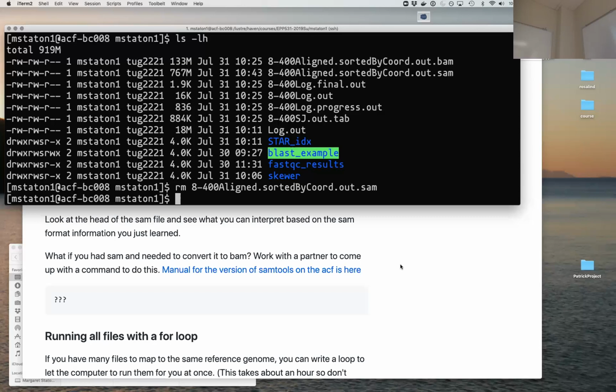I think this is a much bigger issue. You're getting like a third of the file. It's a massively different size file. And that's what I'm thinking. The question is, I don't know how STAR does it. It's a column sample, maybe column conversion of sample, maybe, I don't know. Mysteries. But the important thing is both BAMs convert back to the same SAM. So the information is still in there. There's no information loss, which is what we care about.